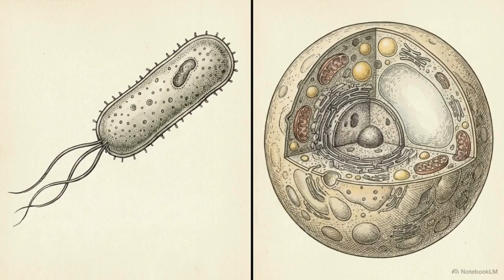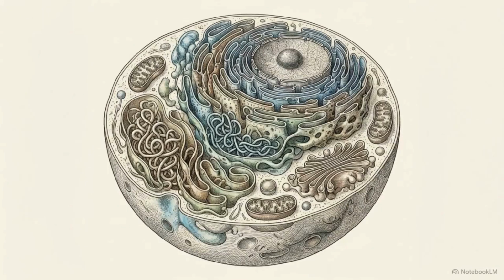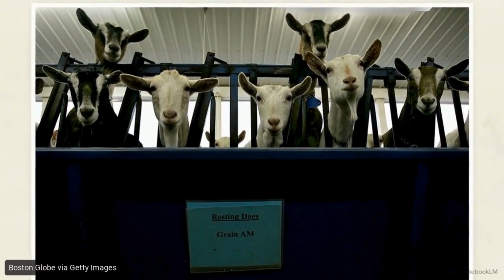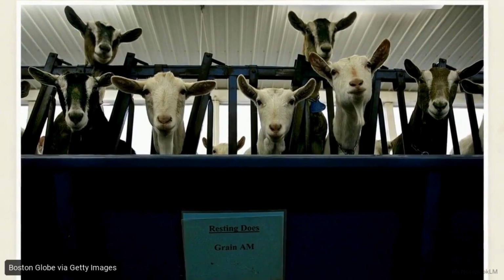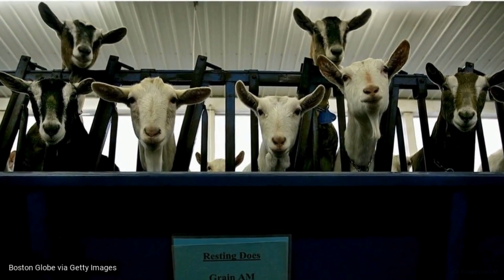To match the complexity of the target, researchers upgrade the host. They deploy yeast, which functions as a robust secretion factory, or mammalian cell lines that offer supreme versatility for processing human biology. When traditional cell vats fail entirely, scientists utilize alternative hosts, engineering specific proteins to be expressed in the milk of livestock, like these goats.